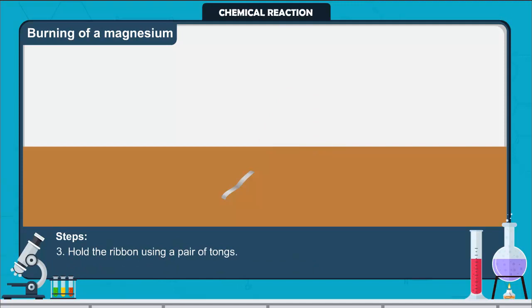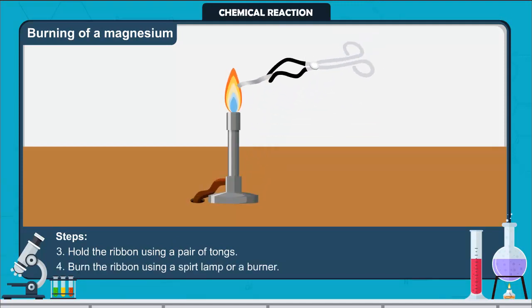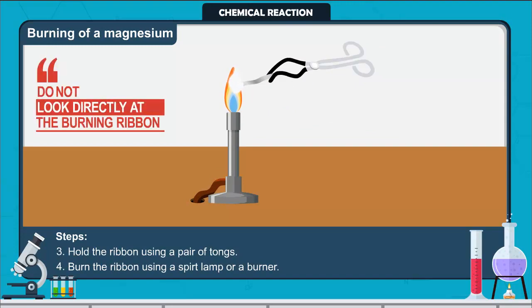Hold the ribbon using a pair of tongs. Burn the ribbon using a spirit lamp or a burner. The burning ribbon should be held at arm's length. Do not look directly at the burning ribbon.